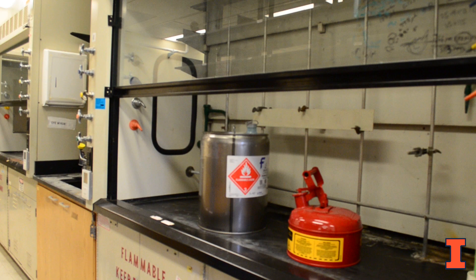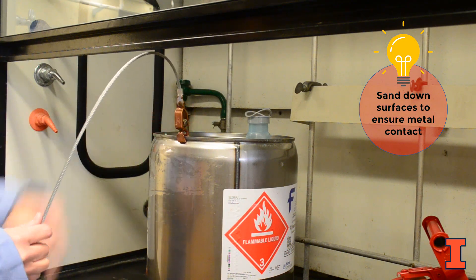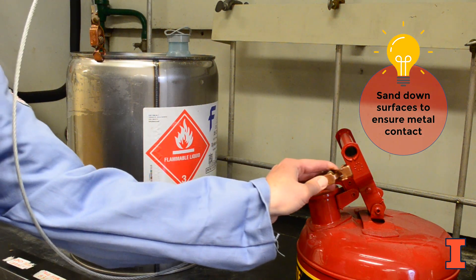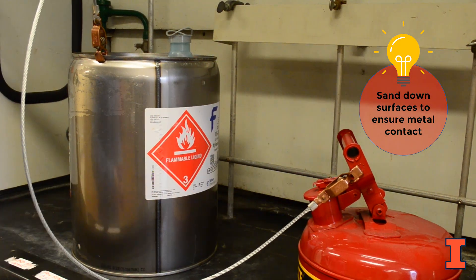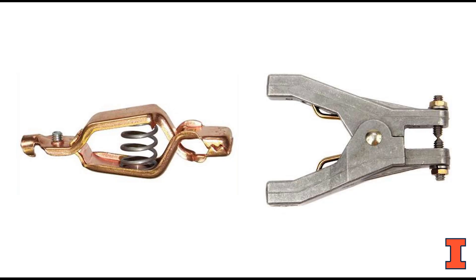To achieve bonding between two metal containers, connect one end of the bonding cable to the dispensing container and the other end to the receiving container. Be sure to remove any dirt or debris from the surface and use bonding cables with strong clamps and sharp bite to ensure proper metal-to-metal connection.